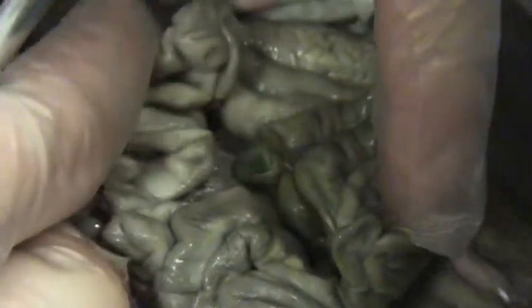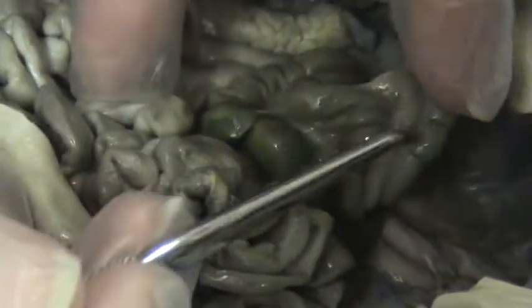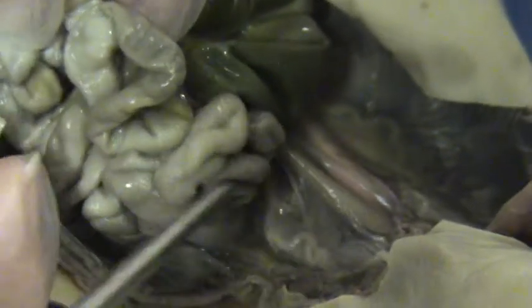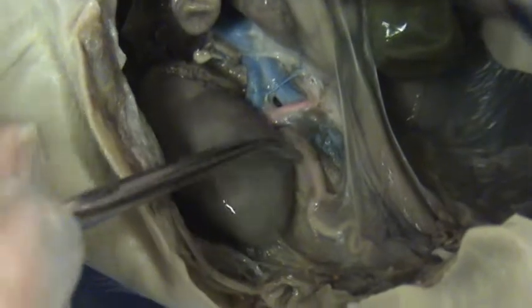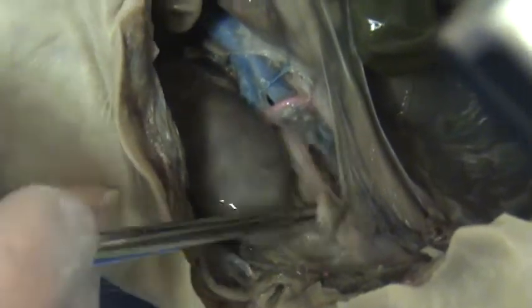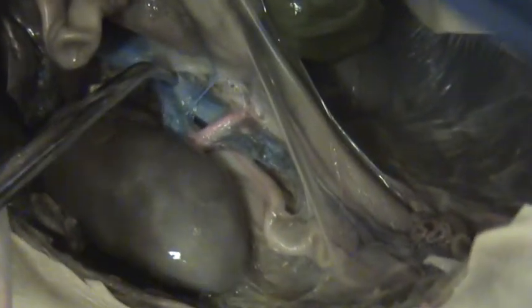The large intestine has 3 regions. The cecum, which I'm looking for. The start. The coiled colon. And the descending colon, going down. Okay. Kidney. Okay. Ureter, going to the urinary bladder. All right, so what's this pink one going into the kidney? Can't see it. Renal artery to the kidney. Renal vein away from the kidney.